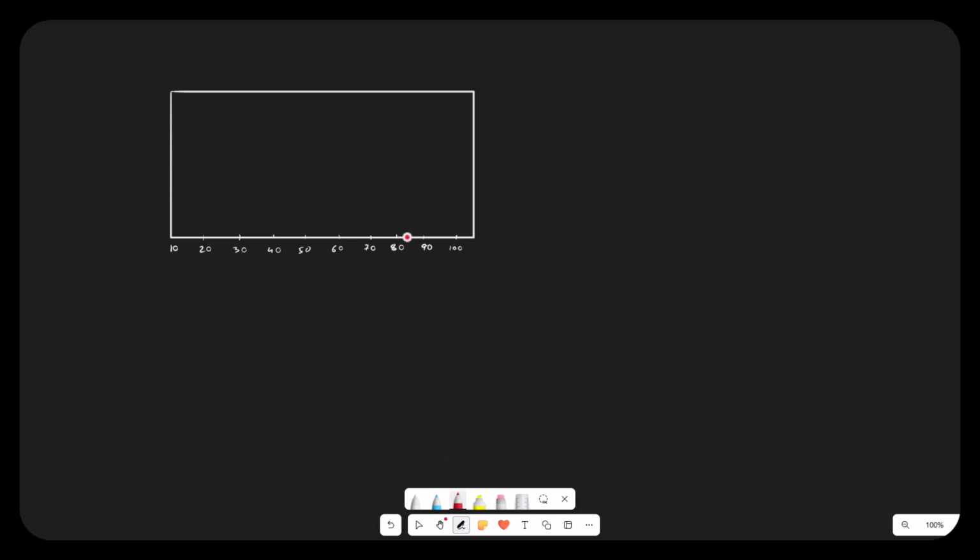Now I just found I had this big signal at 83 AMU. And then maybe I will always have this molecular ion, and that shows up, and that's a little smaller. The idea of that one I will actually come back to. So I get a signal there, I get one here.